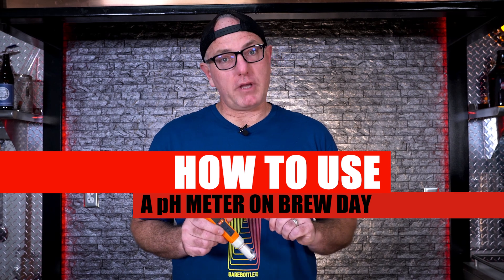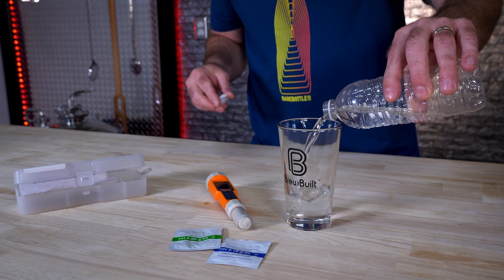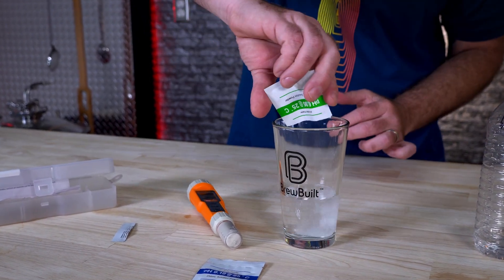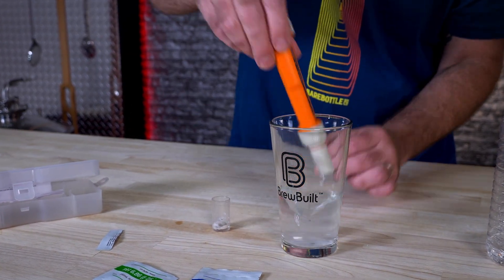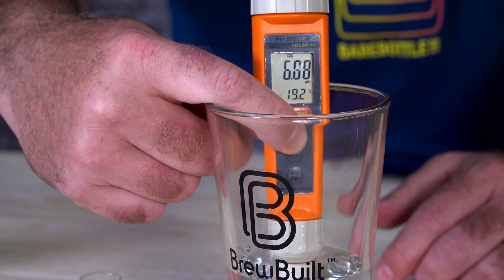Here's how to use a pH meter. It's a good idea to calibrate your pH meter each time prior to using it. This process is quick and easy using the included buffer solutions. You'll mix it up with 250 milliliters of deionized water — RO water works as well. Mix it up, insert the probe, and then hit the CAL button. Hold it down for two or three seconds. It's going to say CAL on the screen, then SA, and then END.